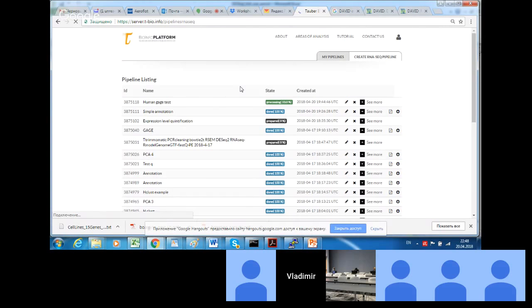For this type of analysis, we initially need to know the groups. So if we have several groups, in the simplest case 2 groups, we can do all the steps, we can identify differentially expressed genes, we can perform gene enrichment analysis, and have its result. So generally it takes several minutes.